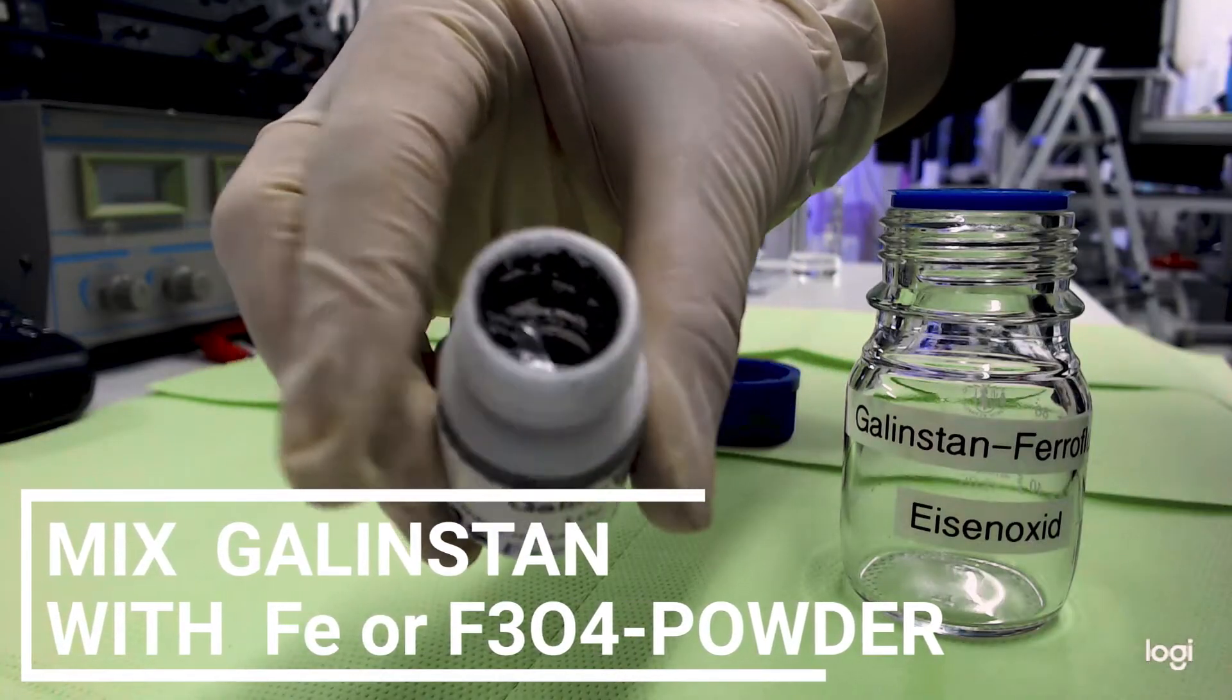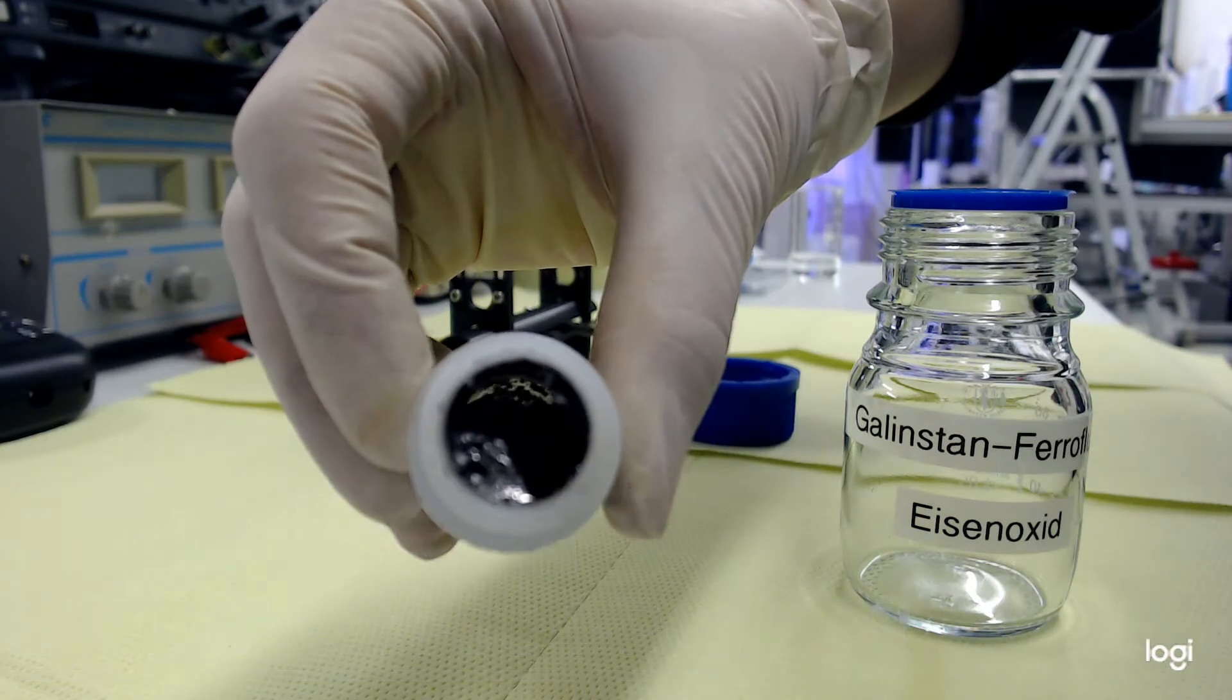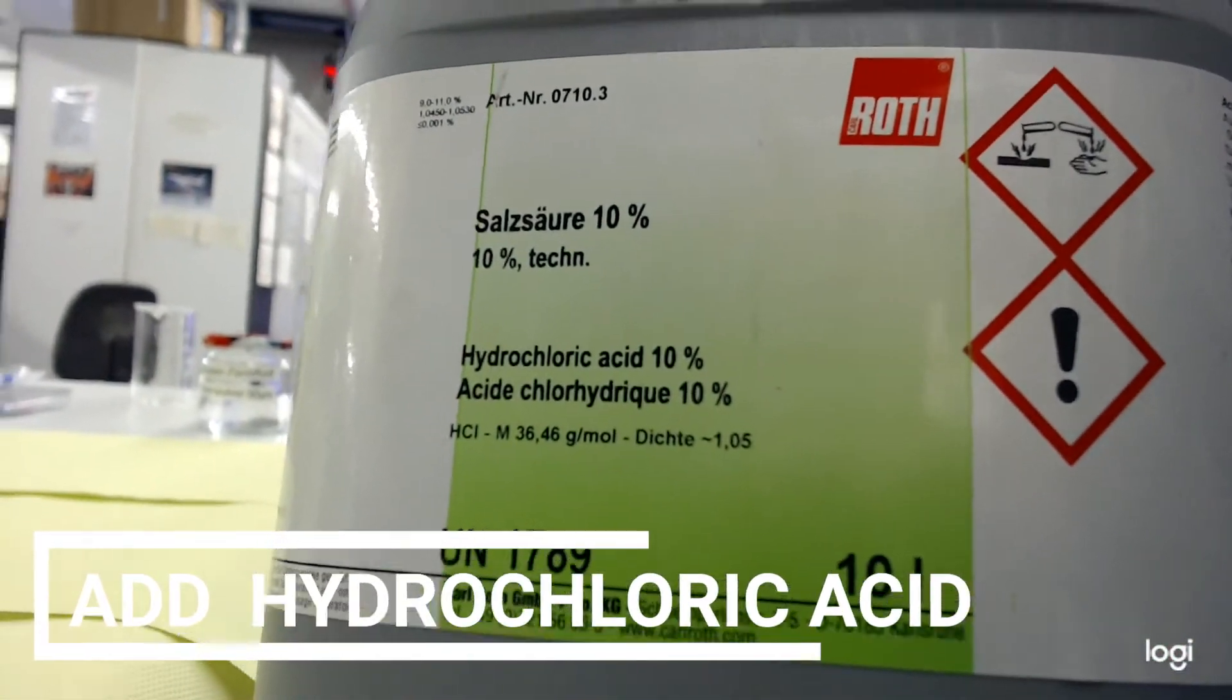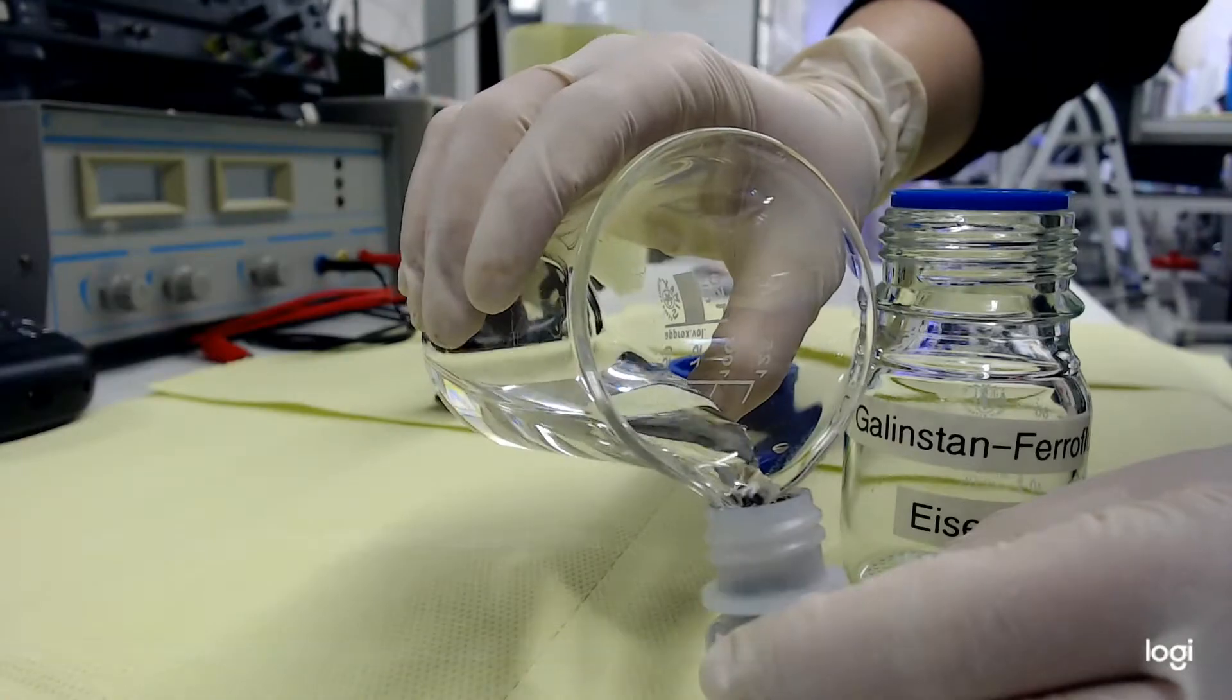To mix the powders, hydrochloric acid has to be used according to literature. We use 10% strength hydrochloric acid in solution.